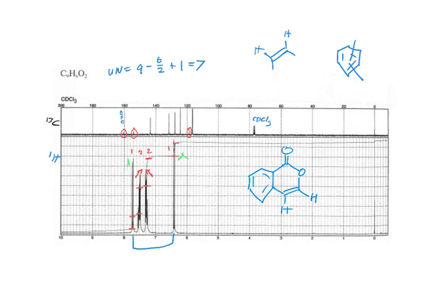We might think that, for example, because this is electron withdrawing, pulling electron density out here, this would be delta plus, and this would be delta plus. So those 2 could possibly be grouped together. I might not even be right here. Oh, we have 2 possibilities. Okay, let's think about that. There's another possibility.